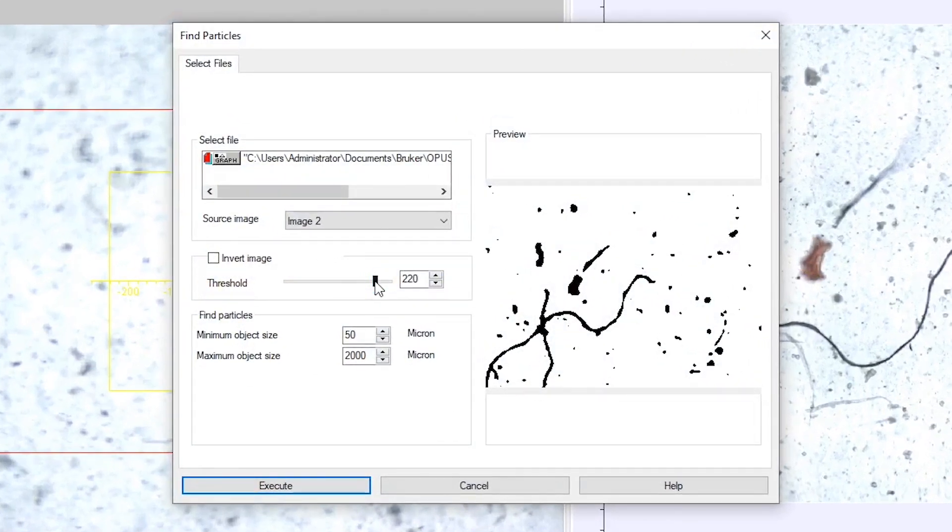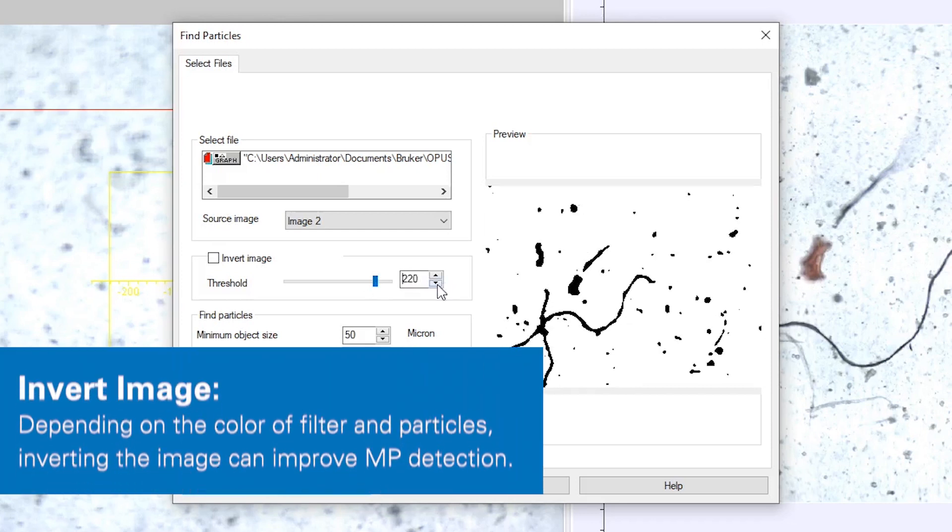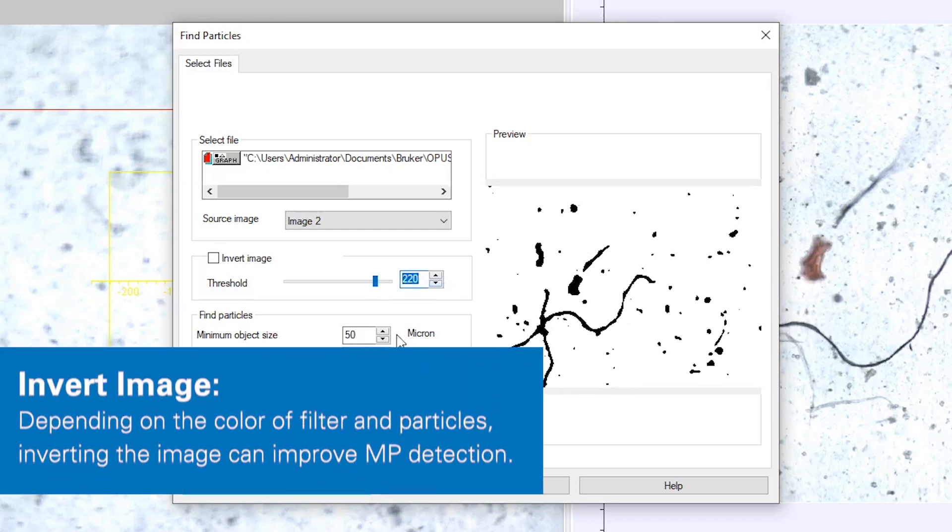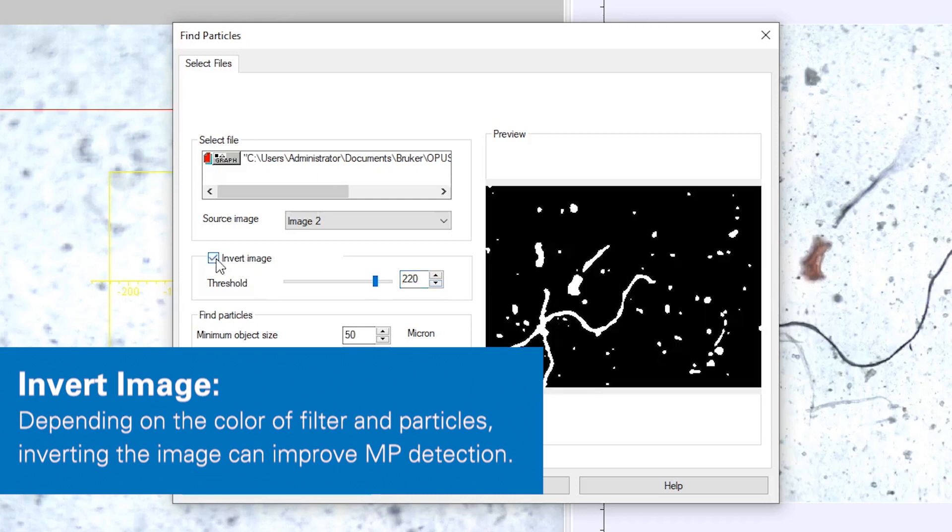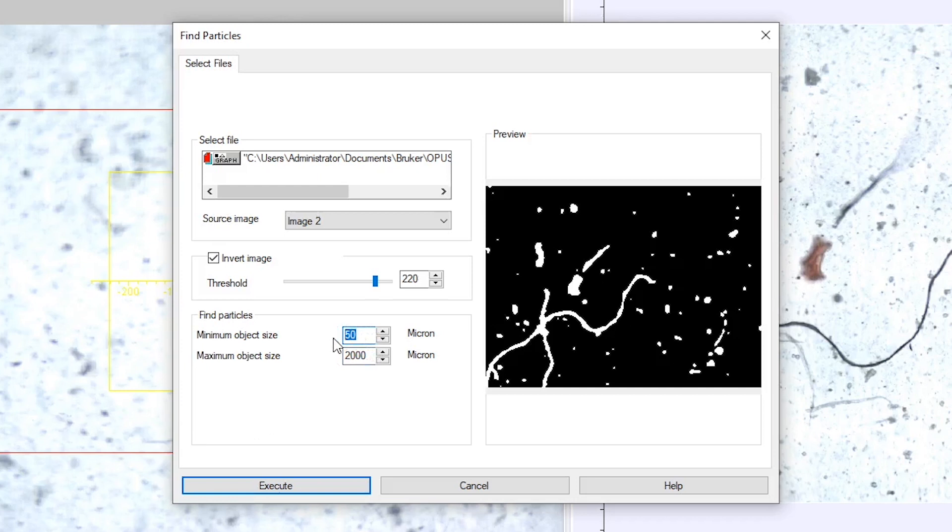To adjust the Find Particles function to your sample, you can adjust the threshold on which an object is recognized based on visual contrast, and you can also invert the image. In the second step, you define a minimum as well as a maximum object size. This means particles smaller than 50 microns and larger than 2,000 microns are not found by the functionality.